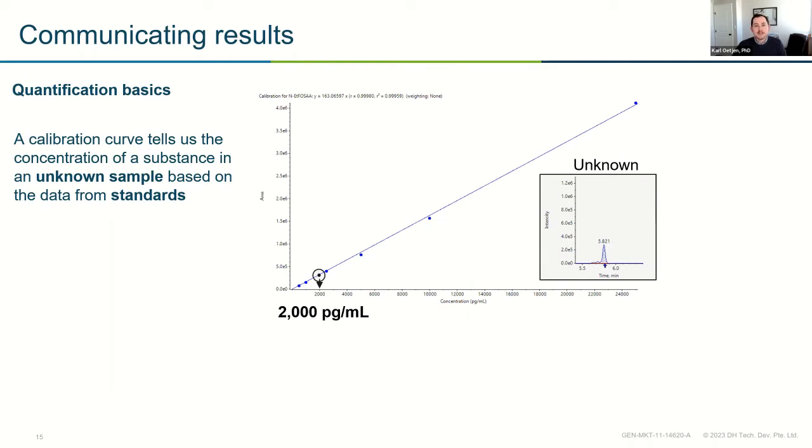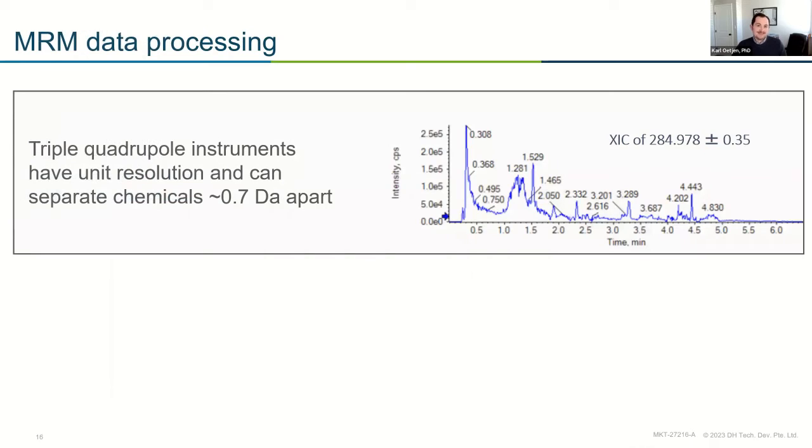So what makes quantitation different on an accurate mass system compared to a nominal mass system? And that's really, as you would guess, the accurate mass. So here I have a spectrum from a nominal mass instrument where we're isolating for a specific ion. So we said, hey, look for this 284 ion. Do you see it? And we're at this point doing no fragmentation.